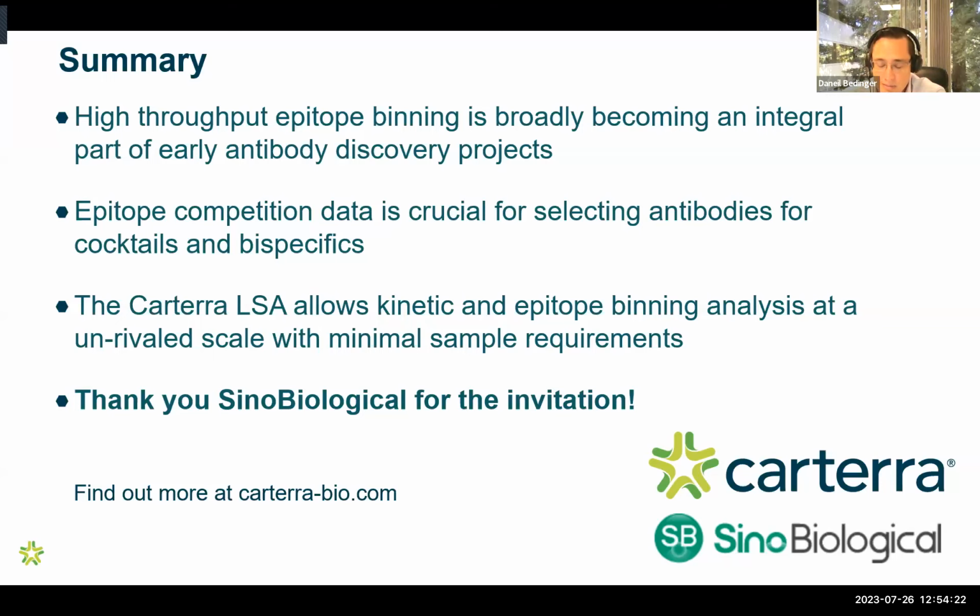We do have some applications around PROTACs, the targeted protein degraders, which are heterobifunctional molecules that are binding to two components. And we measure affinity of ternary complex formation versus the two individual binary complexes. And you can calculate things like cooperativity or inhibition from those by comparing the rate constants. So maybe that's what you're thinking. Yeah, I think that probably answers the question there.